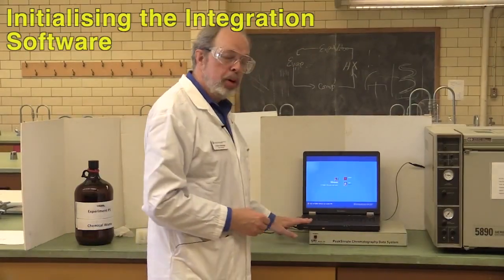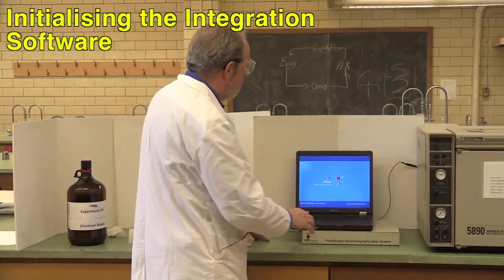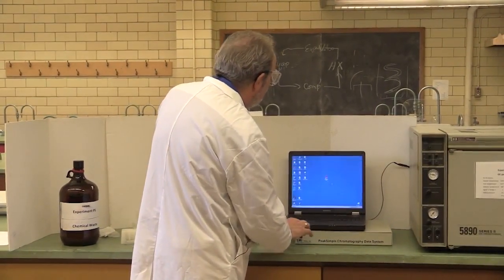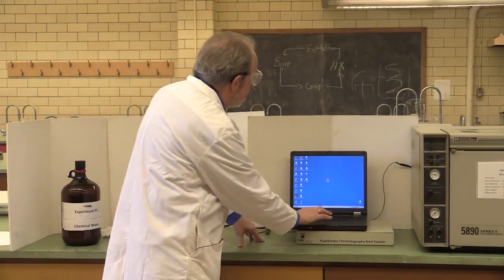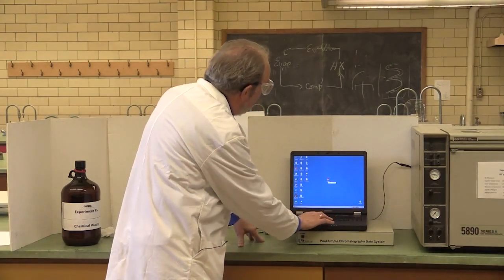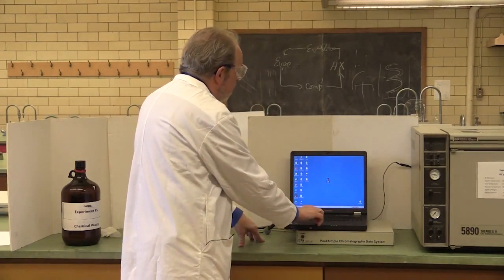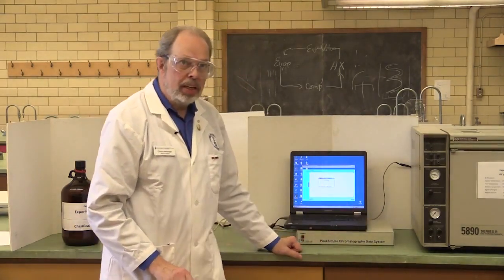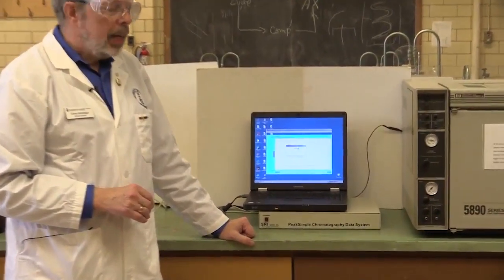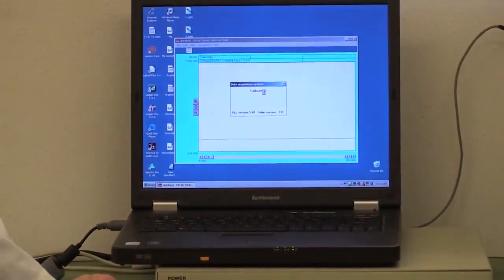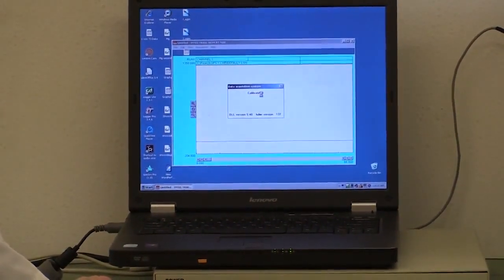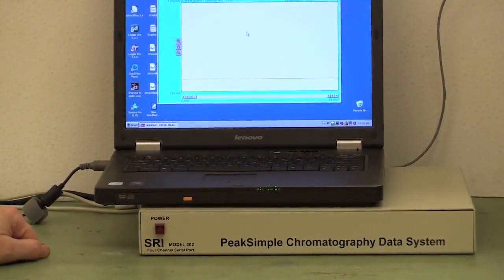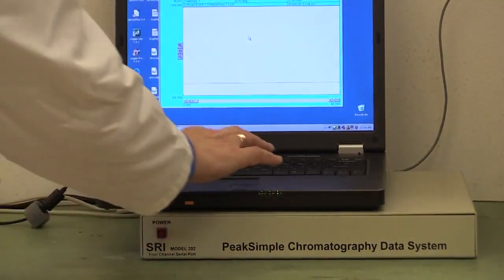Over here on the laptop, your TA will give you the laptop. Invoke this as user. And you want to invoke the program peak simple 2.83. So we'll do that. While that is firing up, this beige box underneath is actually the integrator. It takes the analog signal from the gas chromatograph, converts it into something digital so that the computer can handle it, the information.